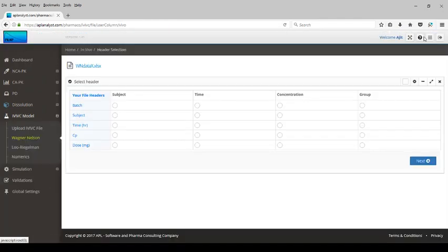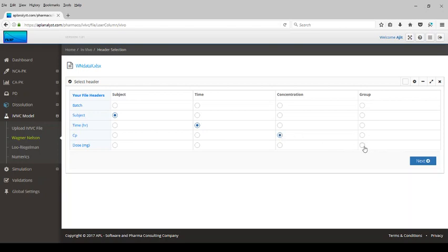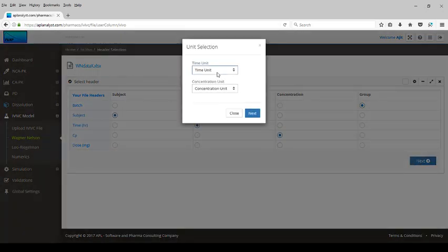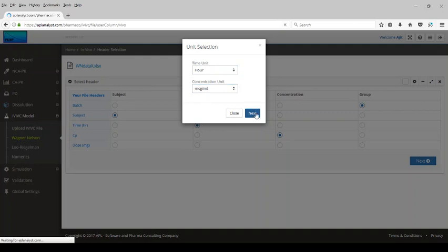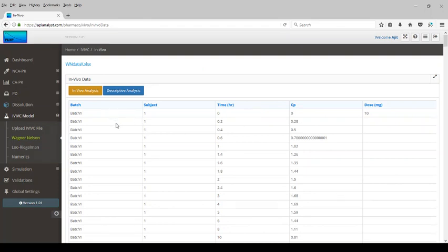Next, let's perform the deconvolution analysis using the Wagner-Nelson method. The file headers need to be matched with the program variables: subject is subject, time is time, CP is concentration. For grouping, we use the batch variable from our dissolution file. Select time units as hours, concentration as micrograms per mL, and click the next button. All data for the three batches is now displayed.